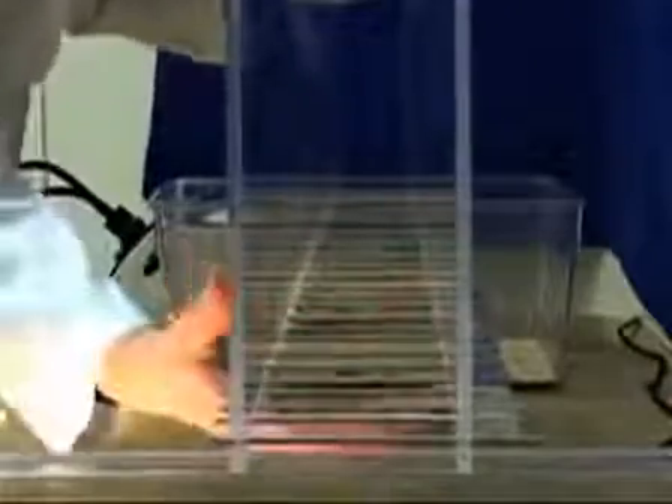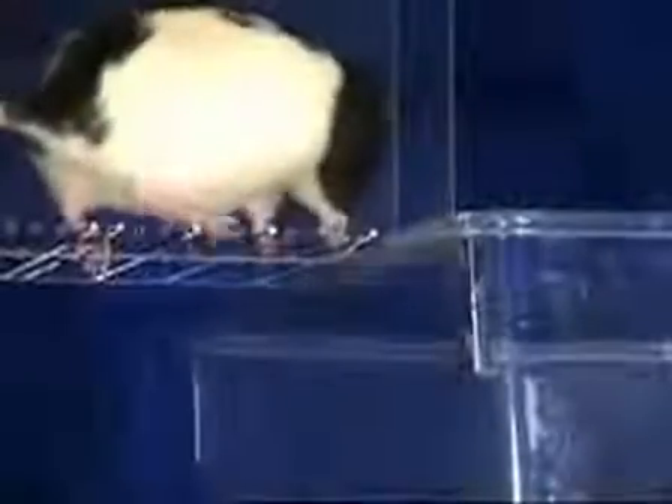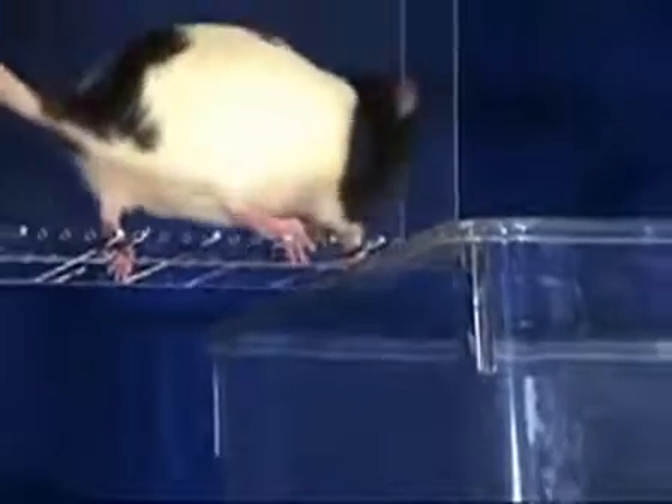If the rat continually turns around in the apparatus, the walls may be spaced too widely. If narrowing the ladder walls does not prevent the behavior, the tester may place a hand in the crossing channel just behind the rat.